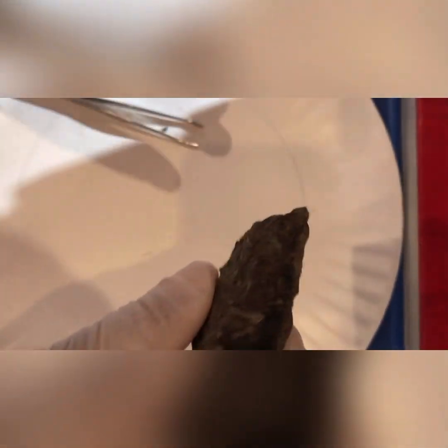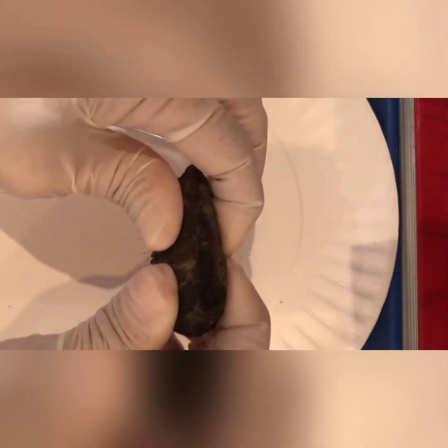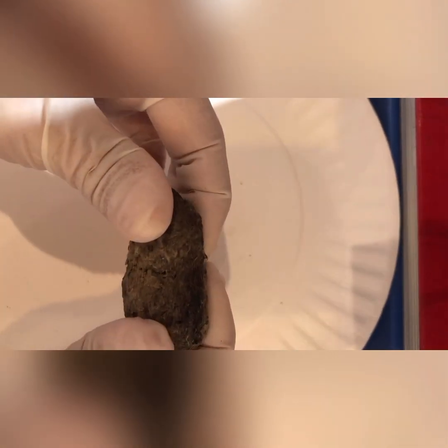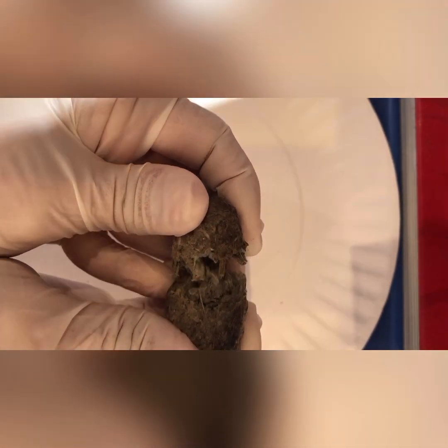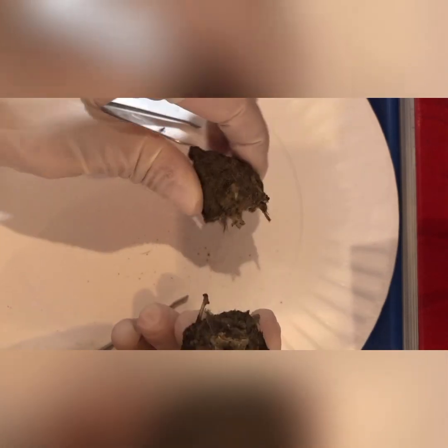And I'm actually going to give it a smell. It doesn't really have much of a smell, but you'll notice it's pretty hard, pretty stiff. And what you want to do is break it up, but when you are breaking it up, you want to find a place where it breaks easily. There are bones in here, and you don't want to break any of the bones because all the bones should be intact.